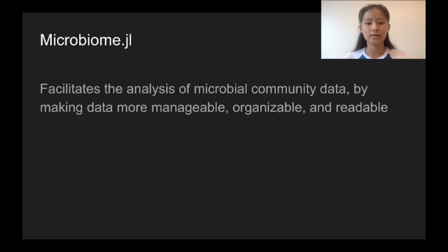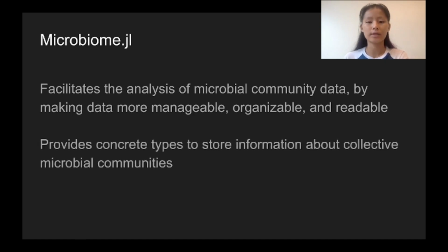Moving on to our own packages, Microbiome.jl, which Kevin will go through in a moment, facilitates the analysis of microbial community data by making data more manageable, organizable, and readable. It does so by providing concrete types to store information about collective microbial communities. And just to note, Microbiome.jl is compatible with many different microbial community data types, not just for metagenomic sequencing.